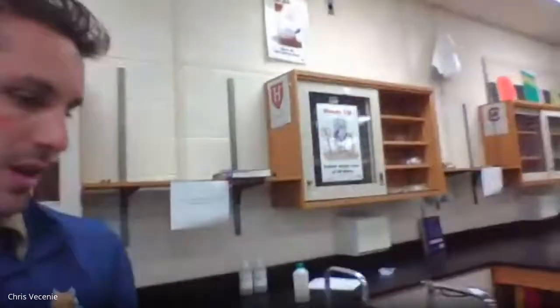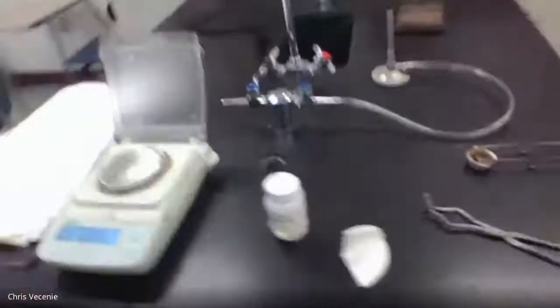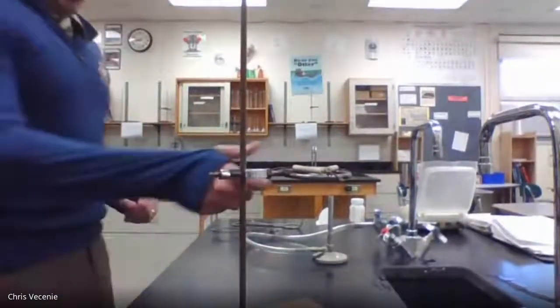When we get back here, just kind of a quick look at our setup. All right, I've got my balance, which we'll be using. Here's some filter paper, some beaker tongs. All right, but I'm going to set you guys up right here, and I'll tip you down and angle this, so you can see what we're doing.